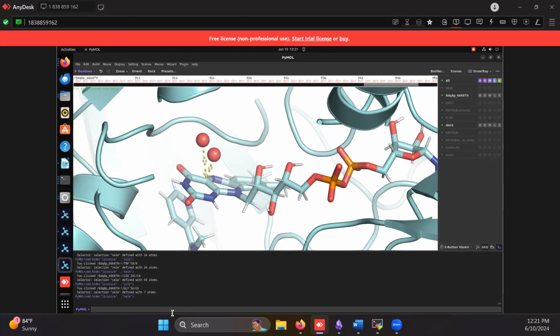To get this distance modifier, I just use the command distance. I think this is something we might use a lot. Distance, name the distance parameter, which is this, or distance selection, which is just distance 1. I'll say, hey, I want a distance between, I name this oxygen oxy 916, since it's the 916th residue. Give me the distance between oxy 916 and I specifically selected the C4X carbon.